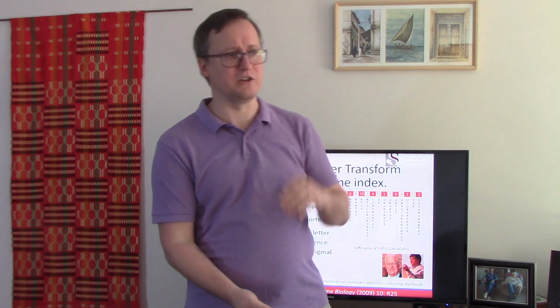So let's start in the abstract. I have a sequencing read. It is, let us say, 60 nucleotides long, and I want to find where it fits in the human genome. So if you imagine this as something you would do on your desktop, you might imagine that you have a Word document containing the entire human genome, 3 billion nucleotides long. So it's pages and pages of A's, C's, G's, and T's. You now want to search for where, and let us assume that it hits just one place, but maybe it hits multiples. I want to find all the locations in the human genome where this read is a perfect match.